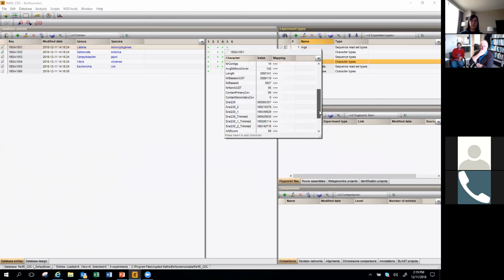Some other metrics, there's a lot of metrics here, but we don't necessarily look at all of these in order to assess the actual overall quality. We look at a few specific metrics so far, and some of those would be the length. If we're dealing with Listeria monocytogenes, we're expecting anywhere between 2.8 to 3.1 million base pairs. This length falls within that line, so we are good there. Number of contigs typically are less than 100 for Listeria, so we've got 19, that's really good.